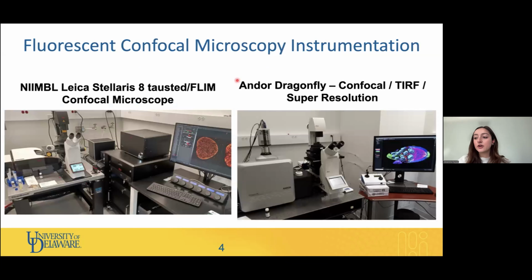I am trained on two microscopes. I have experience with the Leica Stellaris and the Andor Dragonfly super resolution microscope, but all of the images that I'll be showing you in this presentation were taken using the Andor Dragonfly.